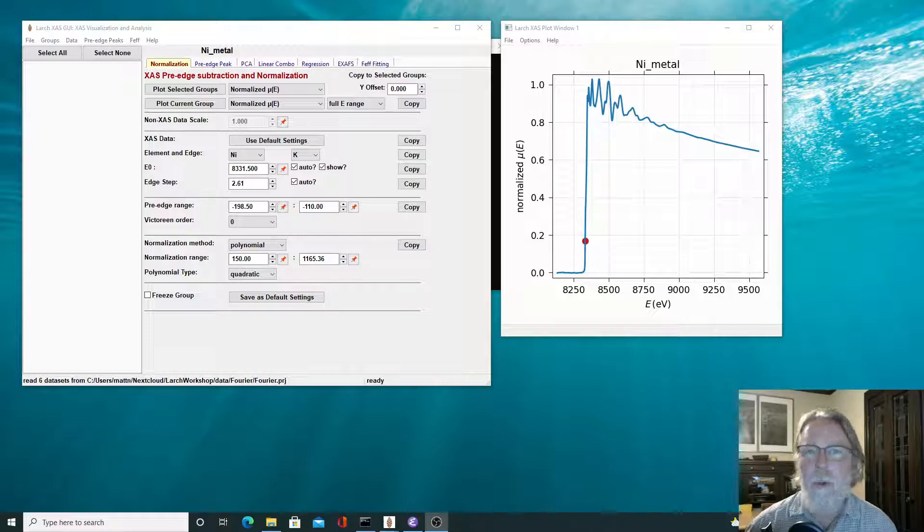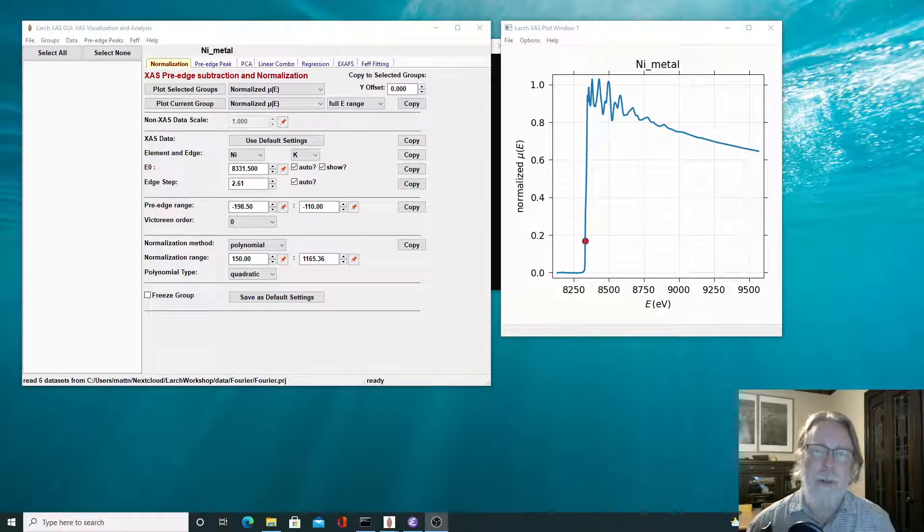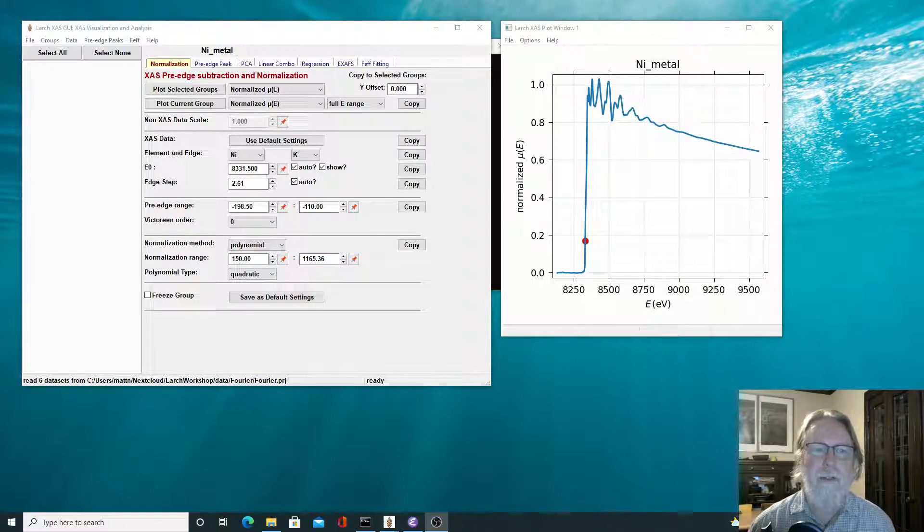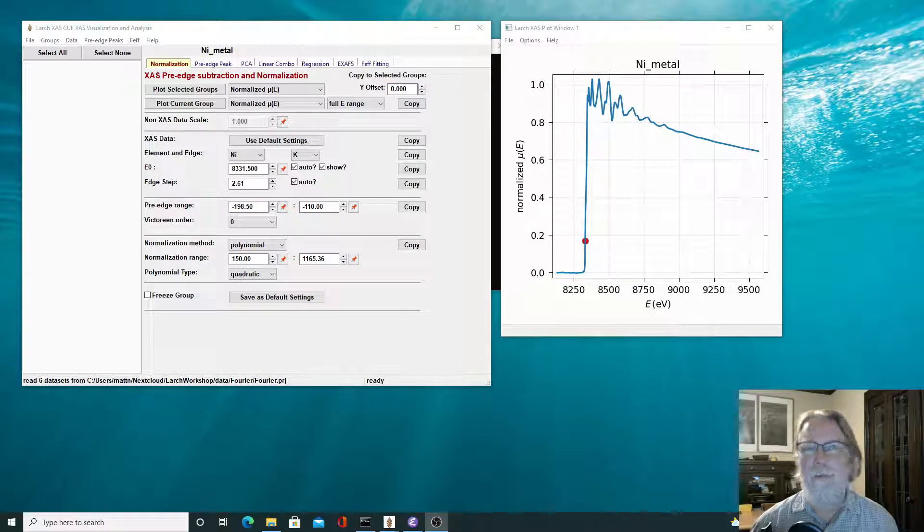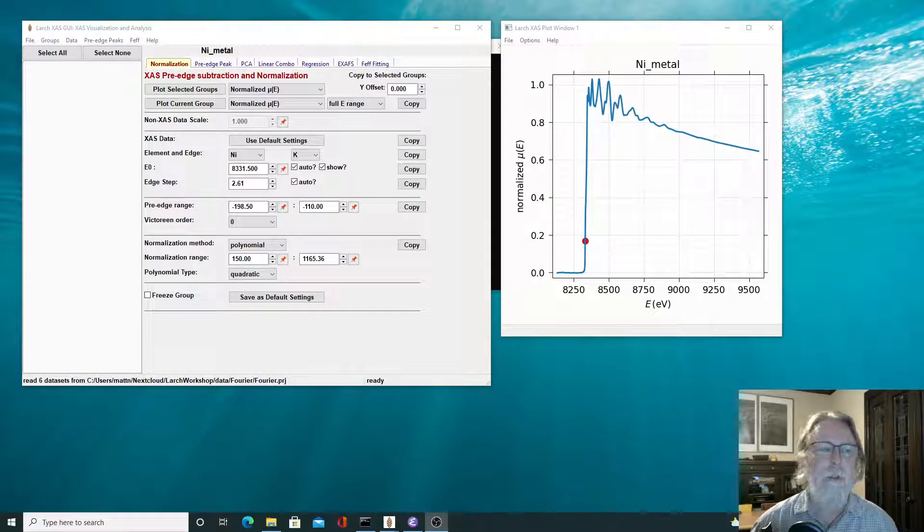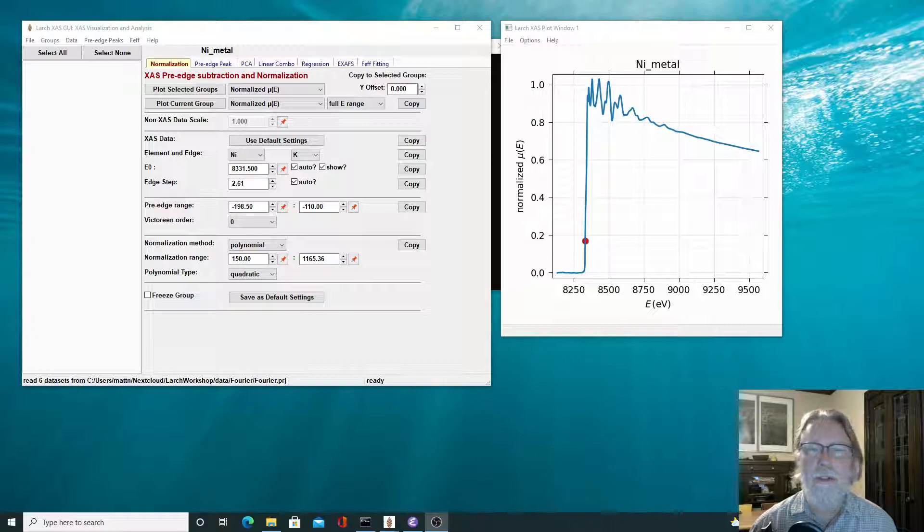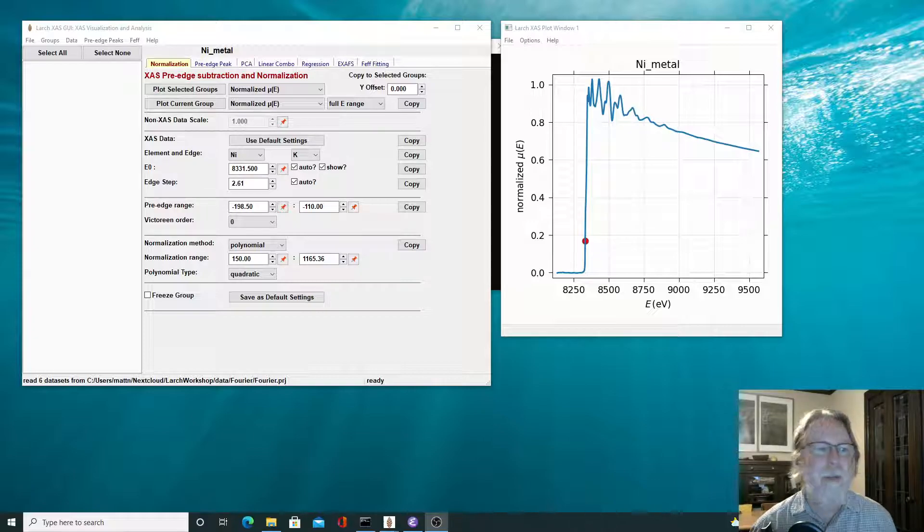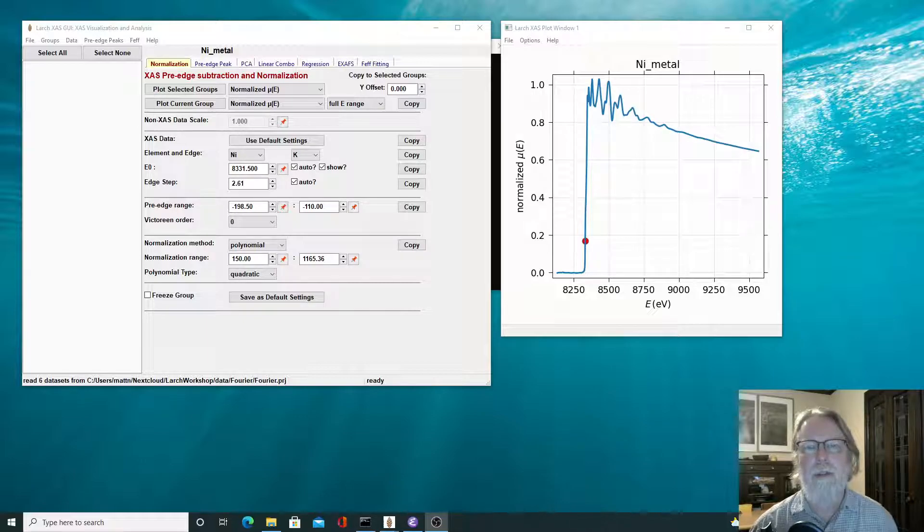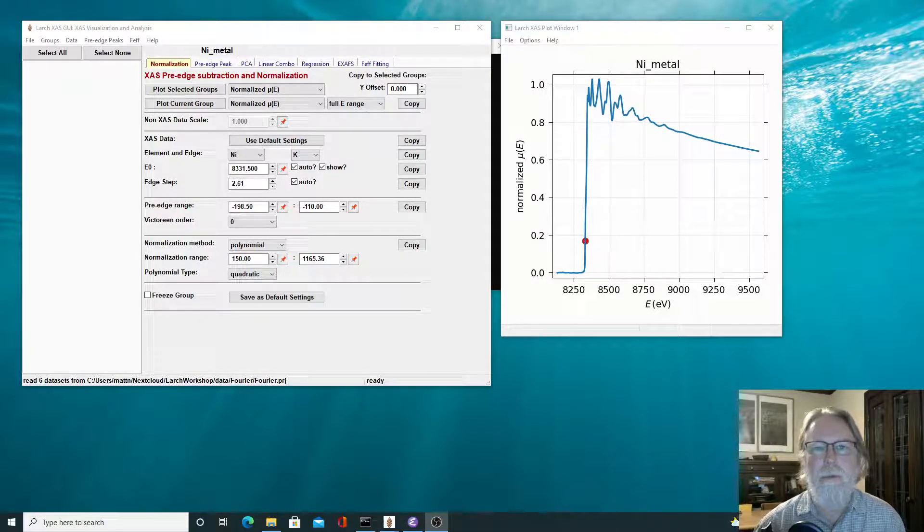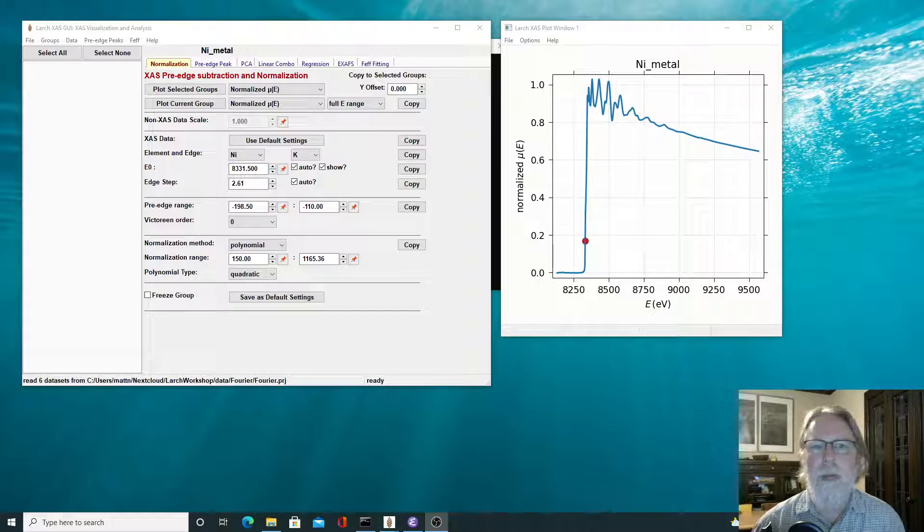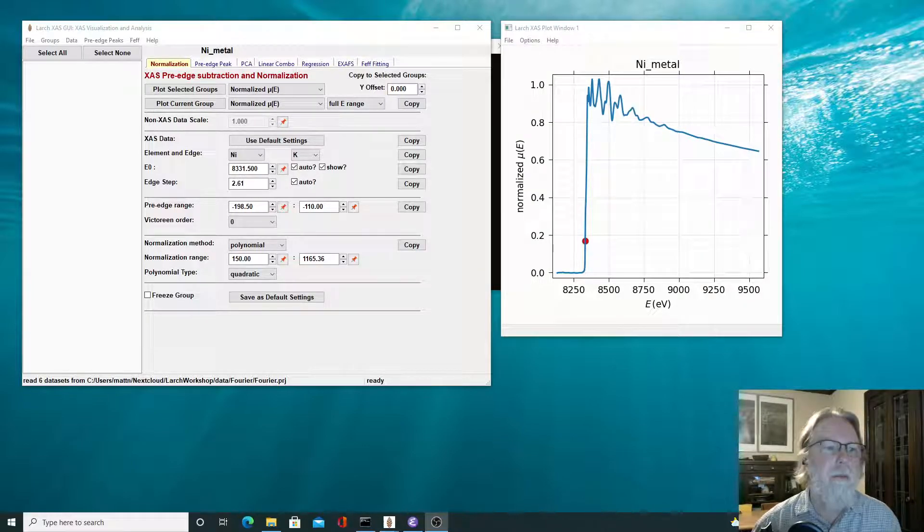In fact, the qualitative description that we're separating the XAFS oscillations from the slowly varying part of mu of E gives an important clue, and using that clue and the Fourier analysis that we've described in the previous video helps us to do background subtraction in a way that's simple and robust and with few variable parameters that we need to play around with.